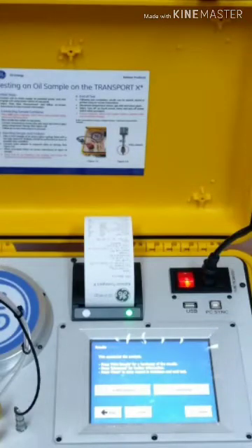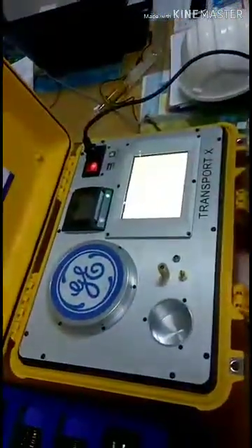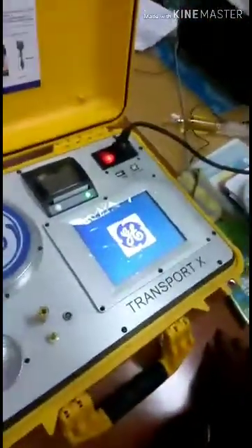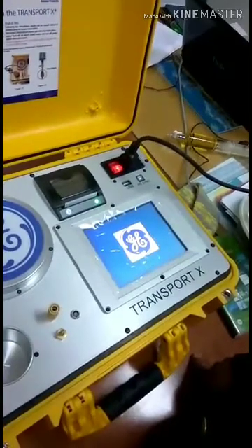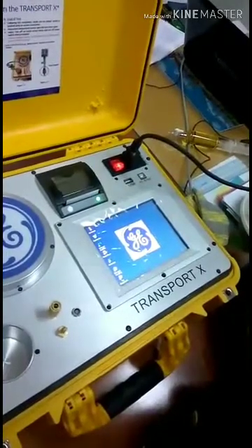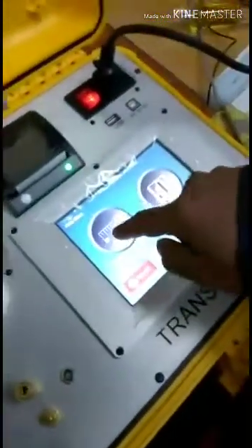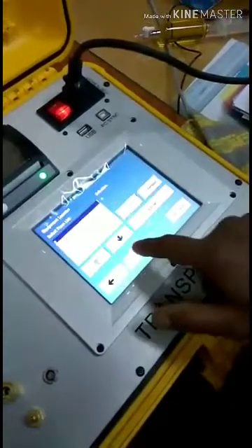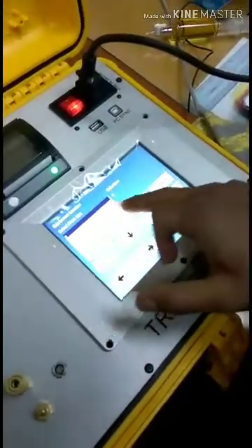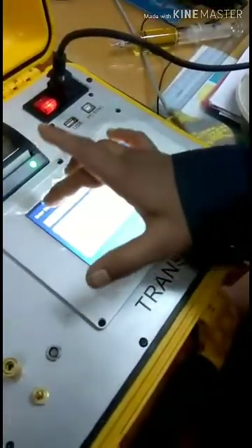Line 1 location. Line 1 number bit. 718.